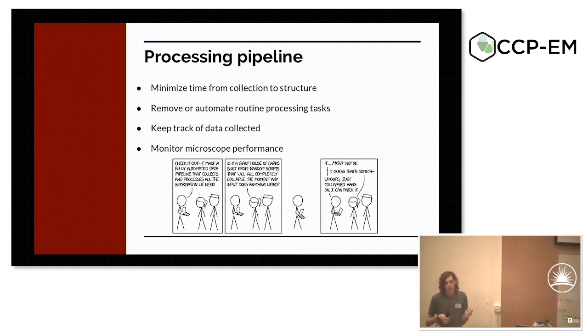Now, of course, this automation comes at the cost of flexibility. We have a system that will work for most cases, and a user with little to no command line experience or EM experience can come, start running the software, and they will get an output. The downside is we trade off flexibility. If an advanced user comes with a particular set of parameters that they always use, we can't really accommodate that easily without increasing the complexity of the system. And that's something I will come back to.